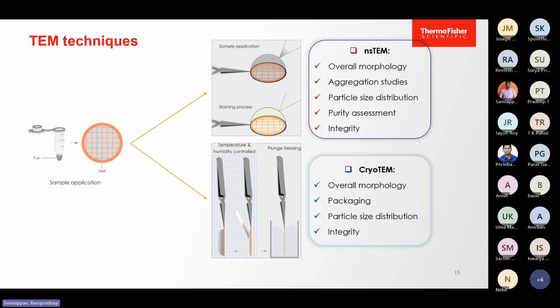Okay. So when it comes to the NS-TEM process, what are the things that we can visualize? If you prepare your particle of interest, let's say protein samples or virus samples.